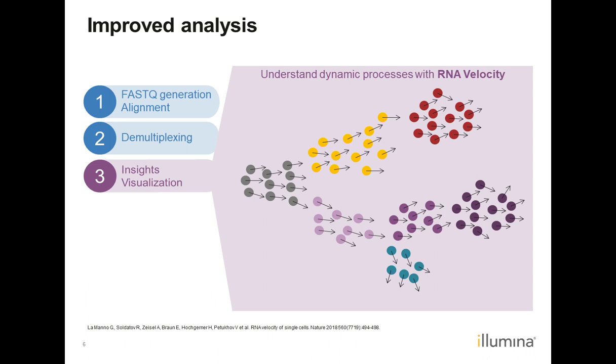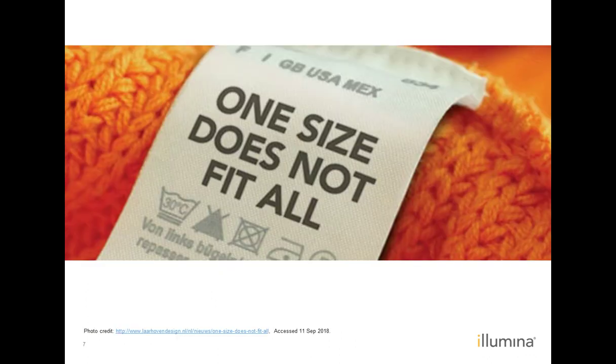With this, what you can do is follow cellular trajectories and see how development is proceeding. The beauty of this application is that you do not need to rerun your experiment, actually. You simply need to reanalyze the data that you already have.